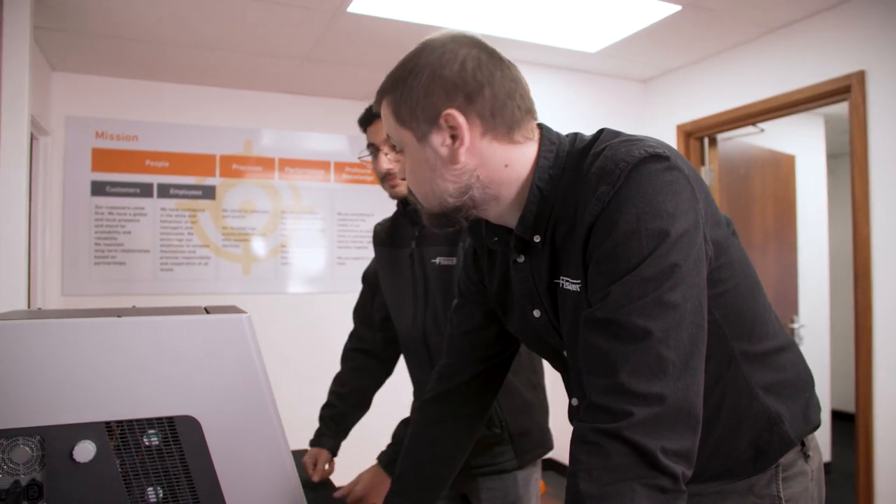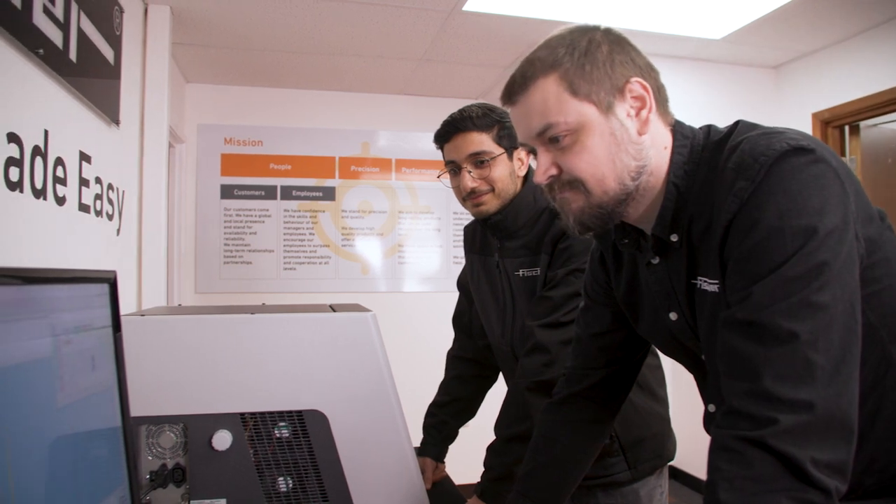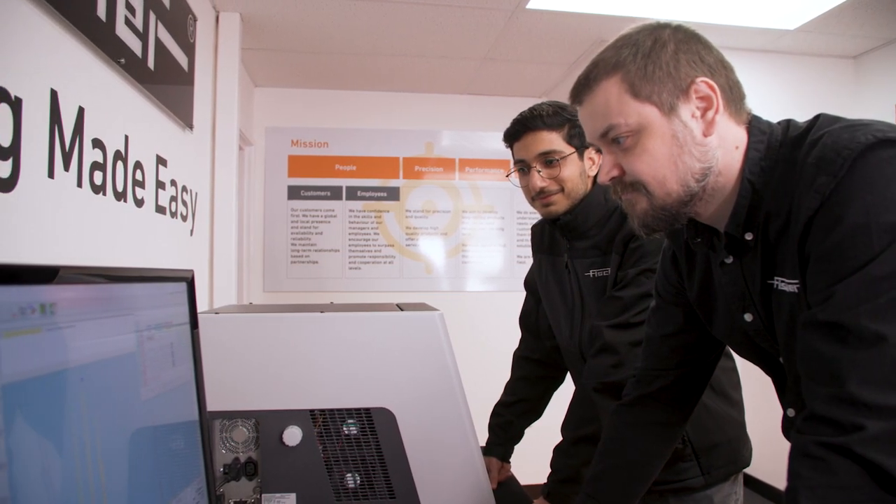In summary, the FischerScope GoldScope 510 can quickly check the authenticity of jewellery and analyse the composition of gold and precious metals non-destructively.